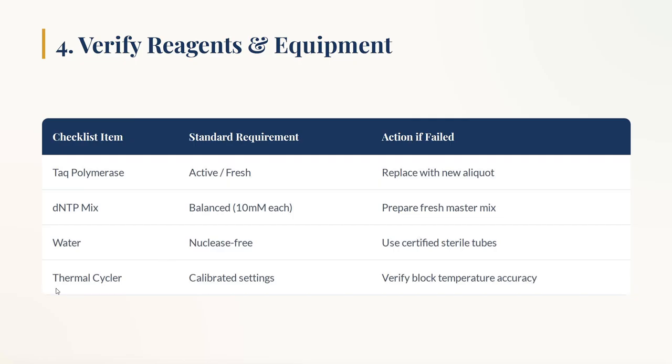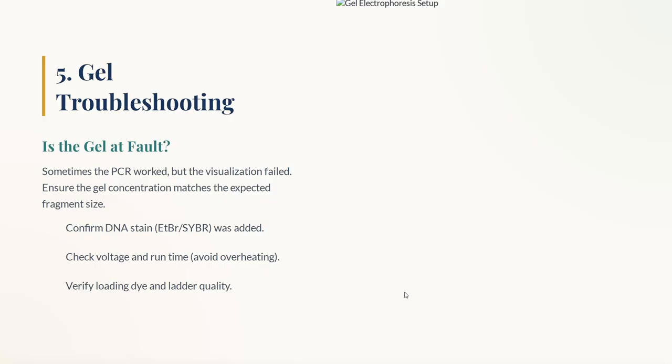Okay, next is the thermal cycler. Of course, this is the least possible condition where you can doubt anything, because generally it doesn't have any issues most of the times. Most of the times we'll have issues with dimers and our own reagents only, but you can of course doubt the thermal cycler also if you feel like everything you have checked correctly and properly, and the only issue is with the thermal cycler. So of course these things have to be checked.